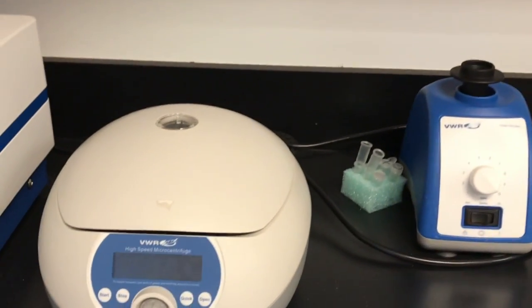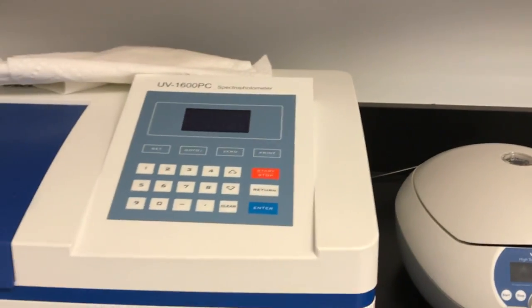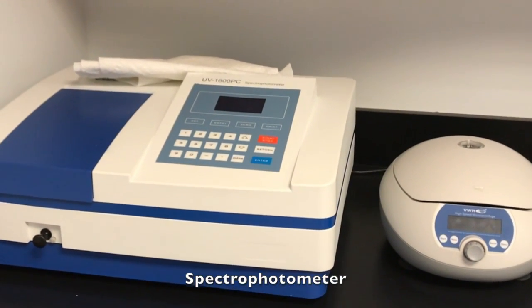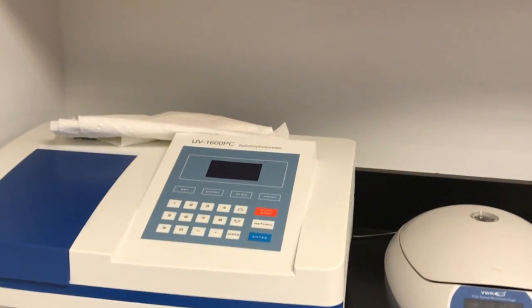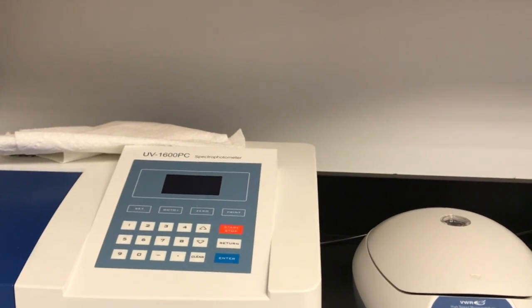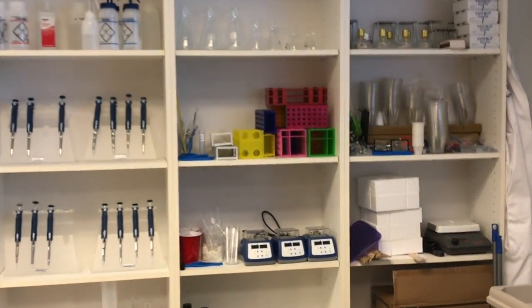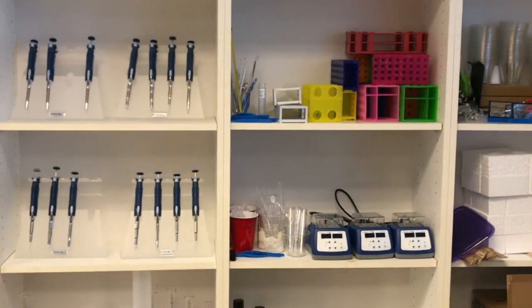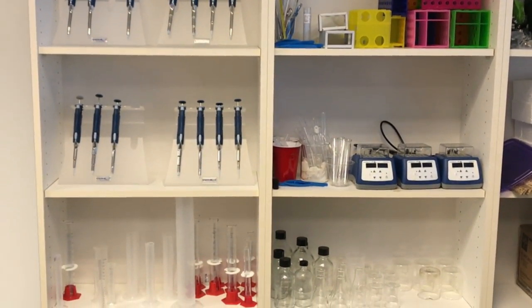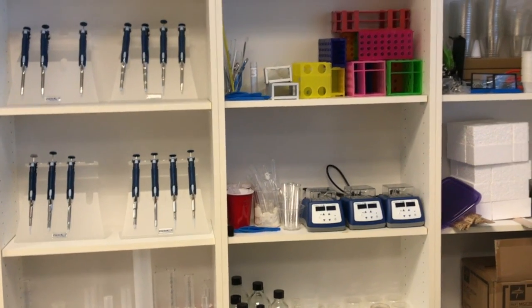For instance, 37 degrees Celsius is the body temperature of a human. There's another centrifuge, another vortex, and this is a slightly bigger centrifuge, so you can see there are several different types. Last, there is a spectrophotometer, which is used to measure — one option is to measure the cloudiness of bacterial cultures, and you can also measure absorbance, so how colorful a sample actually is. On the other side of the lab we have standard lab supplies such as water bottles, ethanol bottles, Erlenmeyer flasks, rags, and pipettes.